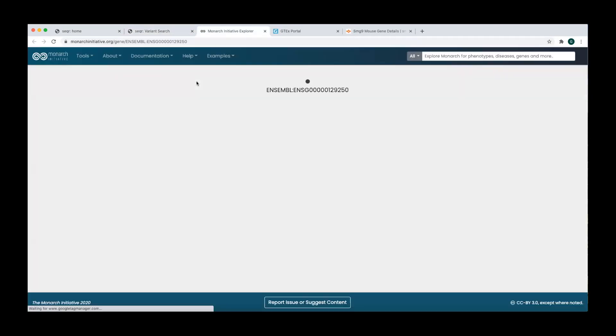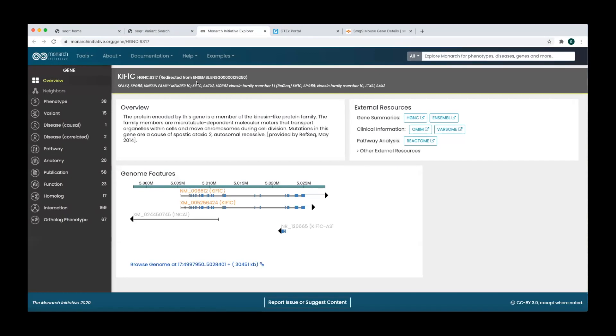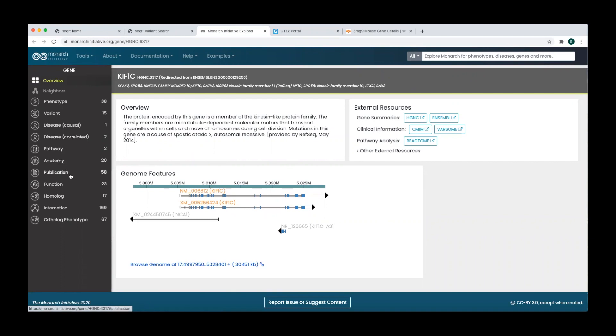Clicking on the MONARCH link will bring you to the entry for this gene from the MONARCH initiative, which presents summarized information about phenotype associations, molecular pathways, published variants, and related publications.